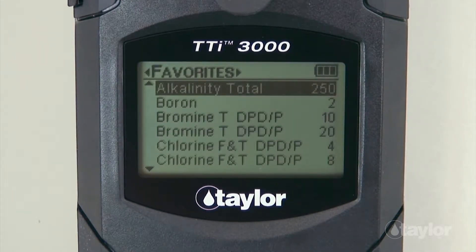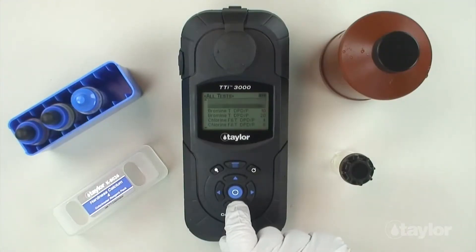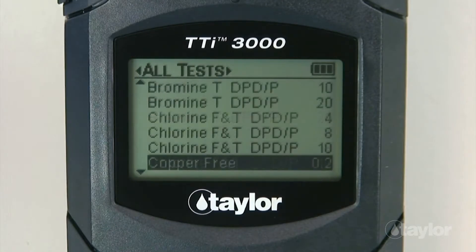For this demonstration, we will select the all tests menu, which contains a list of pre-programmed Taylor tests. If you have added the hardness calcium 4 test to your favorites menu, it can be found there also, or in the recent tests menu if it's a test you have performed within your last 10 procedures. Scroll down to locate the hardness calcium 4 test.